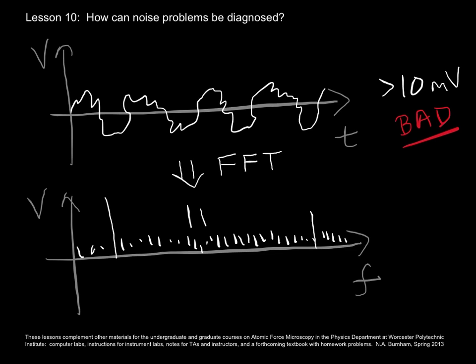There's also an equivalent process for the reverse. You should know about that. That is called the inverse Fourier transform, or inverse fast Fourier transform.